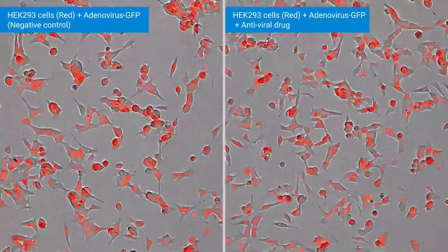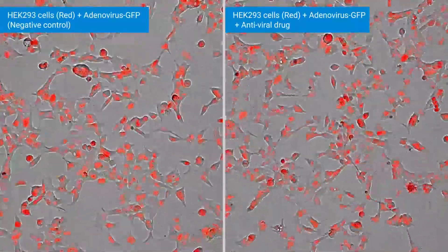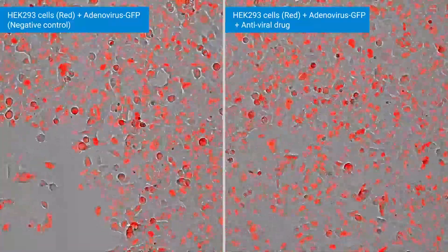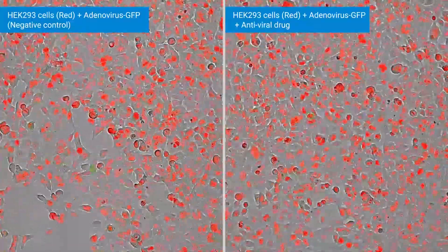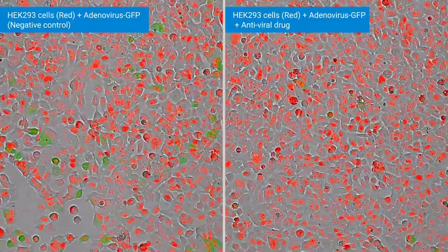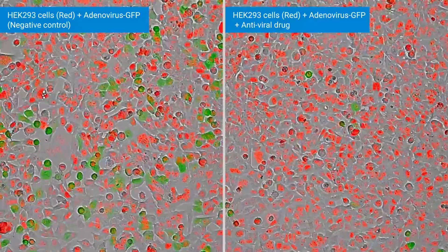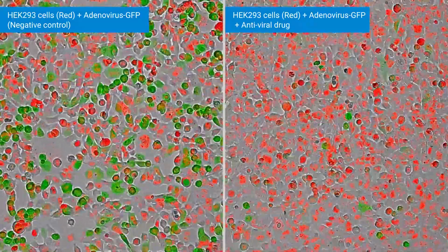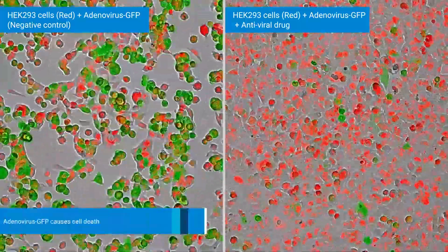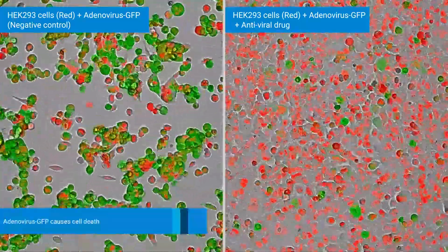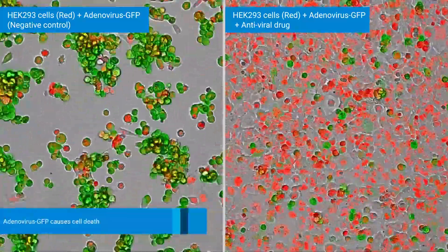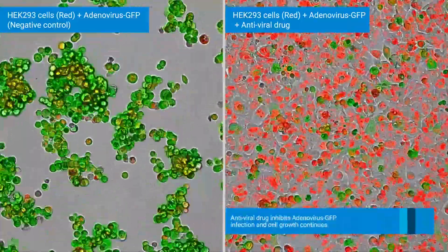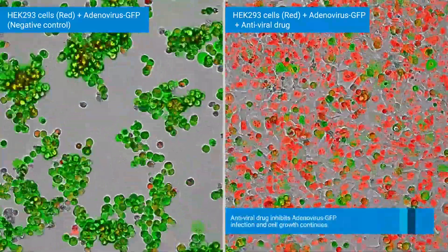Here we show both conditions side by side, without drug on the left and with drug on the right. Although both wells have been infected with adenovirus GFP, the cytopathic effect is much more severe in the absence of antiviral drug. Without antiviral drug, cell death is observed, while the cells continue to grow efficiently in the presence of antiviral drug.